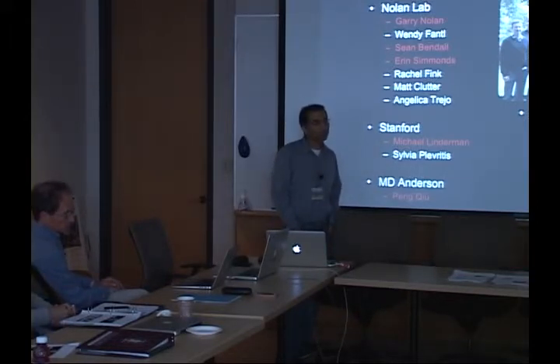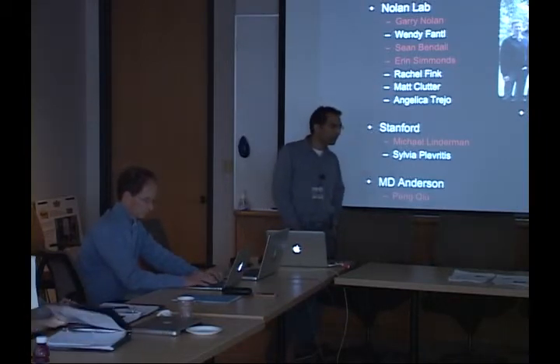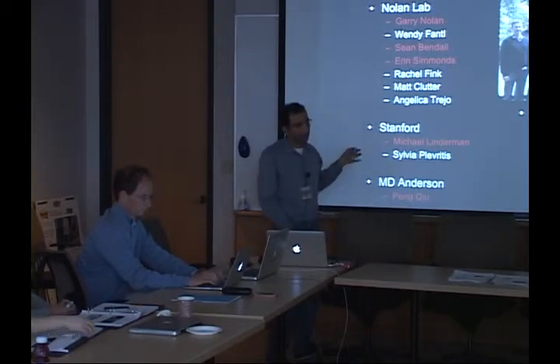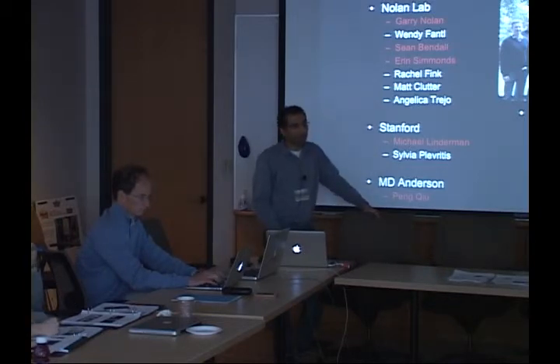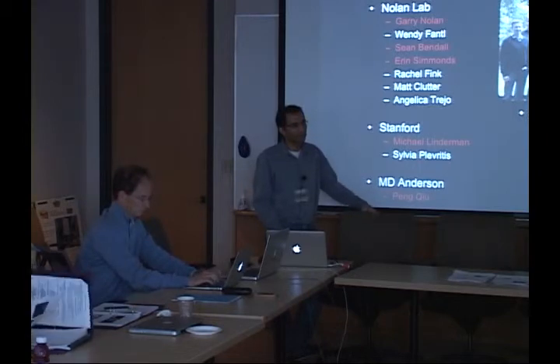So it's phosphorylated RB, but it's the serine 807, 811 phosphosite, which has previously been shown to correlate with the G0, G1 transition. I don't know if it's 100% perfect correlation, but it's very correlated with pyronin Y, which is sort of the gold standard. I didn't show you this, but in that experiment where I had both phospho-RB and pyronin Y, the R squared is like 90-some%. So it's very tightly correlated with pyronin Y. Whether pyronin Y is perfectly correlated with G0 to G1 transition, I think maybe one could have a debate about that, but I think it's as good as what you could do fluorescently.